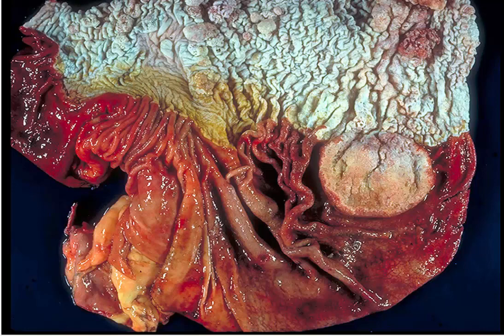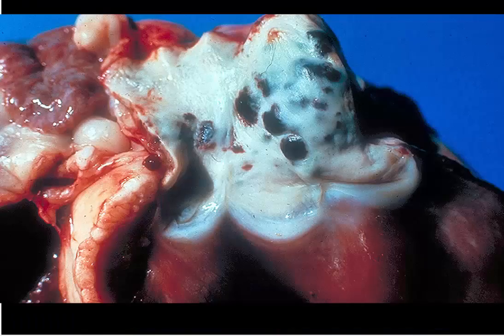Okay, slide number 3 is tissue from a sheep. What I would like for you to do is name the agent and give 2 other possible lesions.